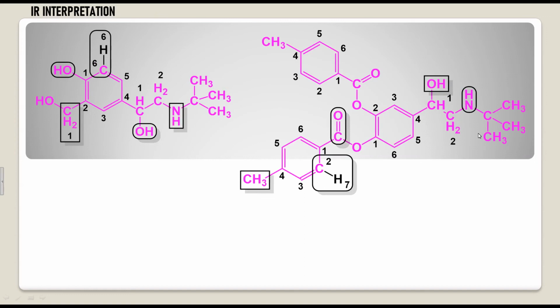Then you have to think of what are all the factors there. Then think of what are all the factors. The factors lie with which zone. You have to club these three. Number 1, structure dismantling based on the functional group. Number 2, what is the factor involved in the structure. Number 3, that factor lies with which zone. It is a free hydrogen zone or a triple bond zone or double bond zone. Finally, whether it is in fingerprint zone.